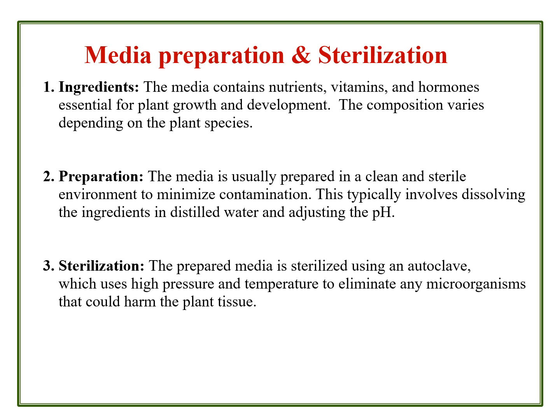And then preparation. The media is usually prepared in a clean and sterile environment to minimize contamination. In the culture room, the room sterilization is already carried out with the help of fumigation. Formaldehyde and potassium permanganate crystals are used to raise invisible fumes that clear any airborne fungal spores, so that the culture room is free from contamination and you can carry on with the media preparation.